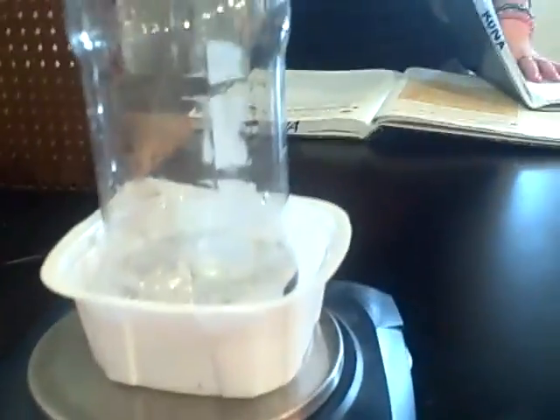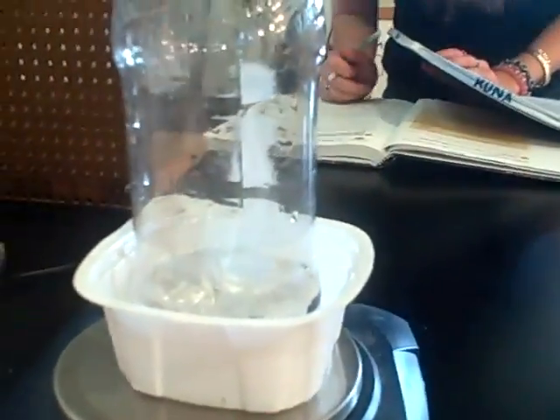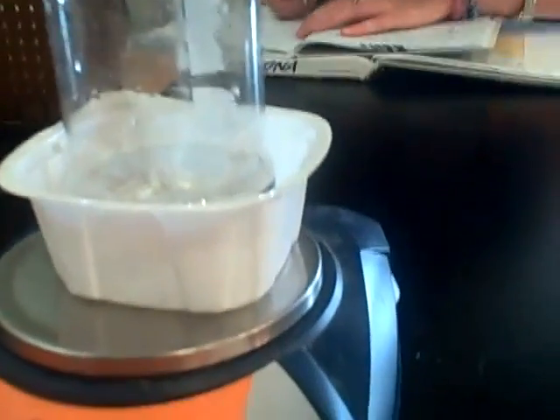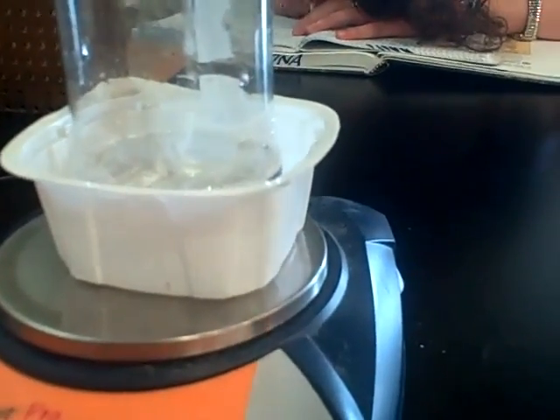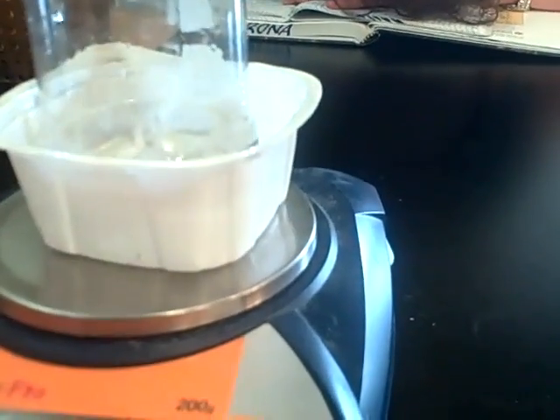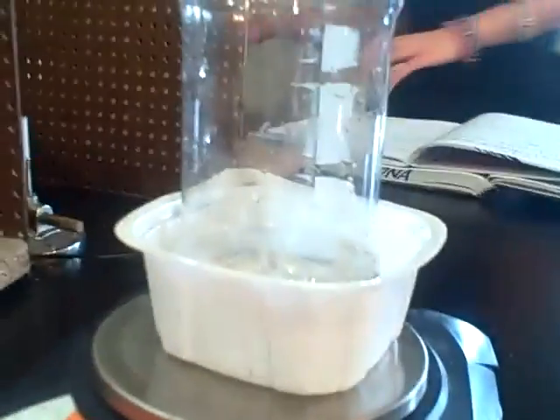Now we're going to re-weigh with the massing scale. We have already tared the scale. It's 107.81 grams. So the final mass is now 107.81 grams.